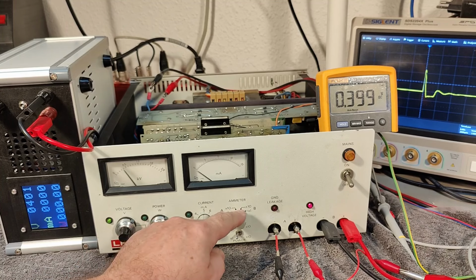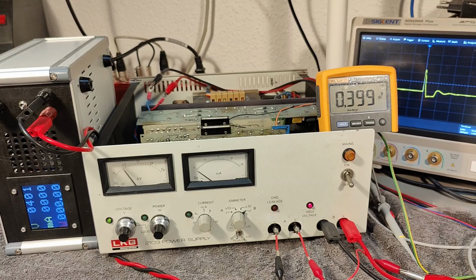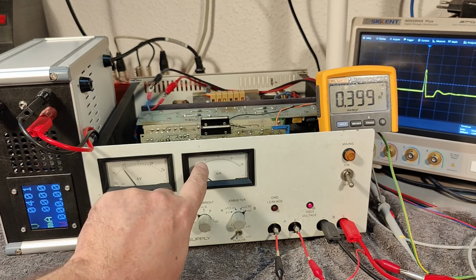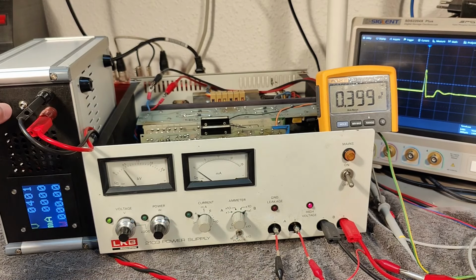So okay, in times 1, this amp meter should be 20 milliamps. So why can't I see the 5 milliamps? Okay, so let's give it 4. So 4 should be right there, but I don't really see anything, do I? I don't see a response.